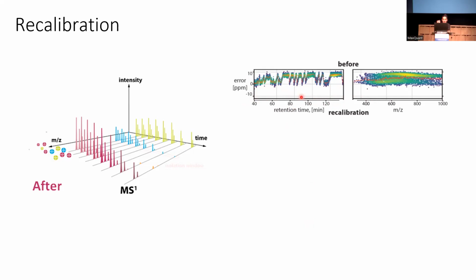All the dots that you can see in this plot are actually the peptide identifications that you found in the first search. And they're all plotted here, and you can see how we can measure the error. The error comes from the fact that, because you have identified the peptides, you know what the mass of the peptide should be, and you also know what you actually measured. So that's why you can measure this error in ppm.